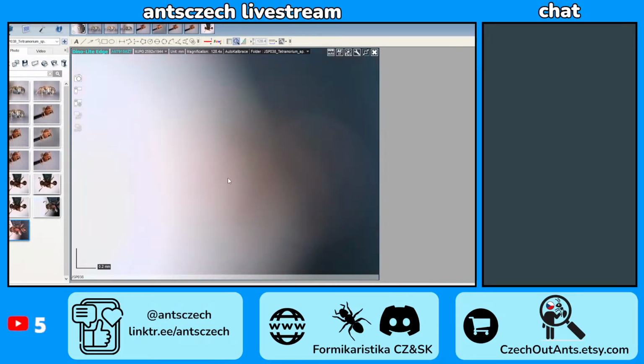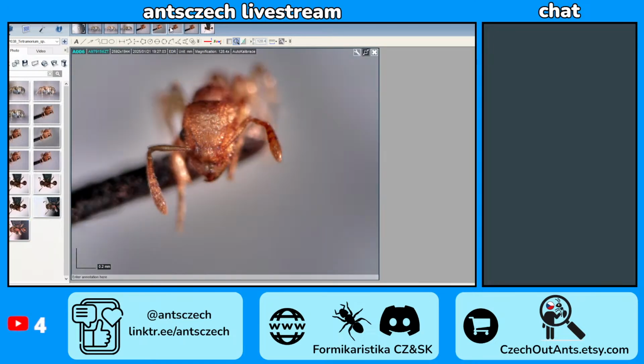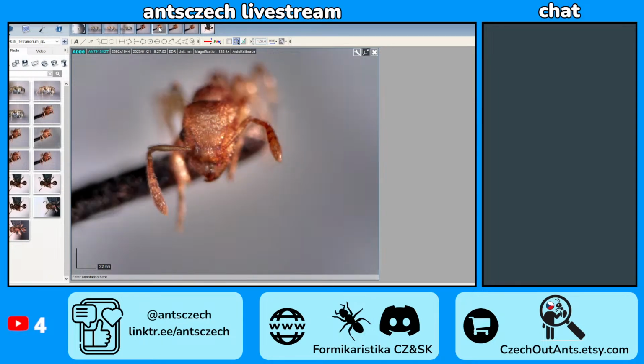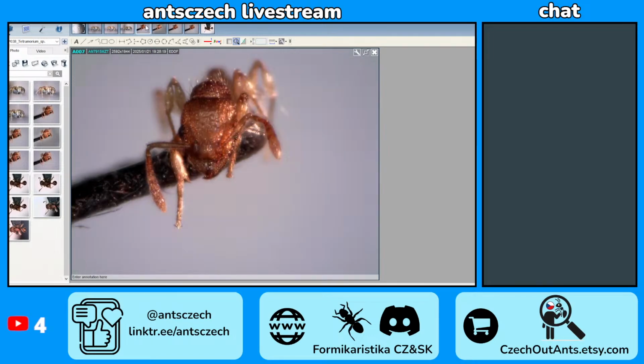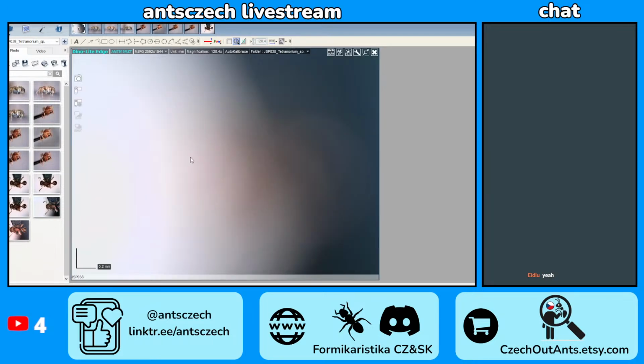So we have all 3 views. Oh wait, yeah, this is aimed at there. I have all 3 views. Fine, I guess. Wait, can I aim?